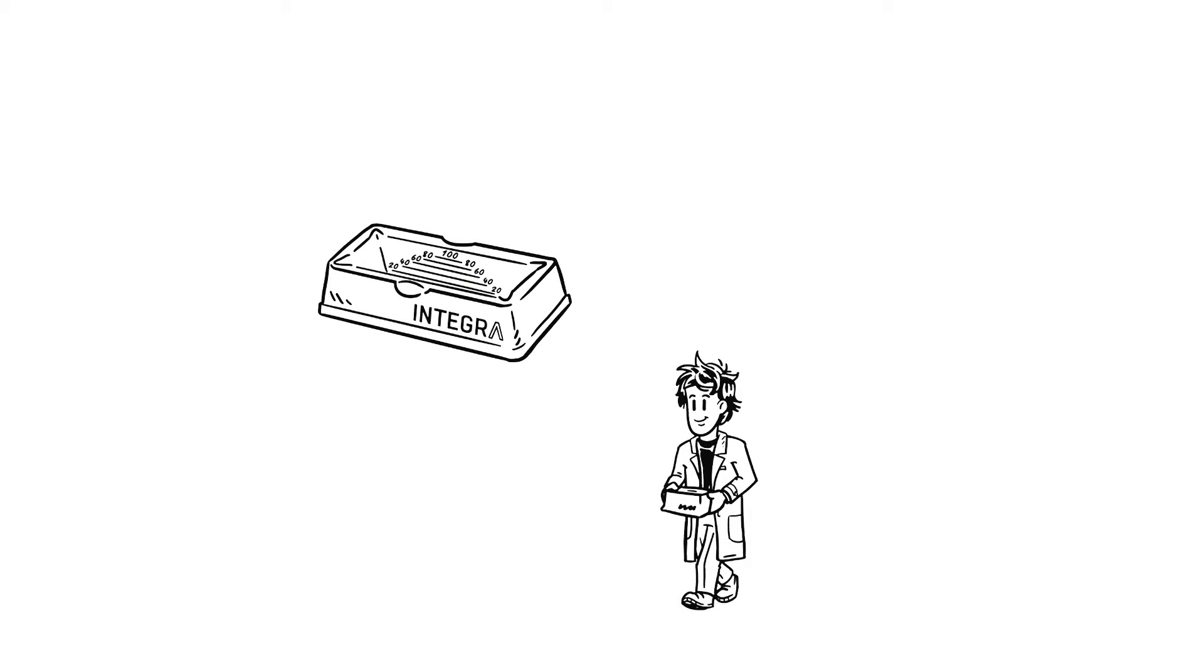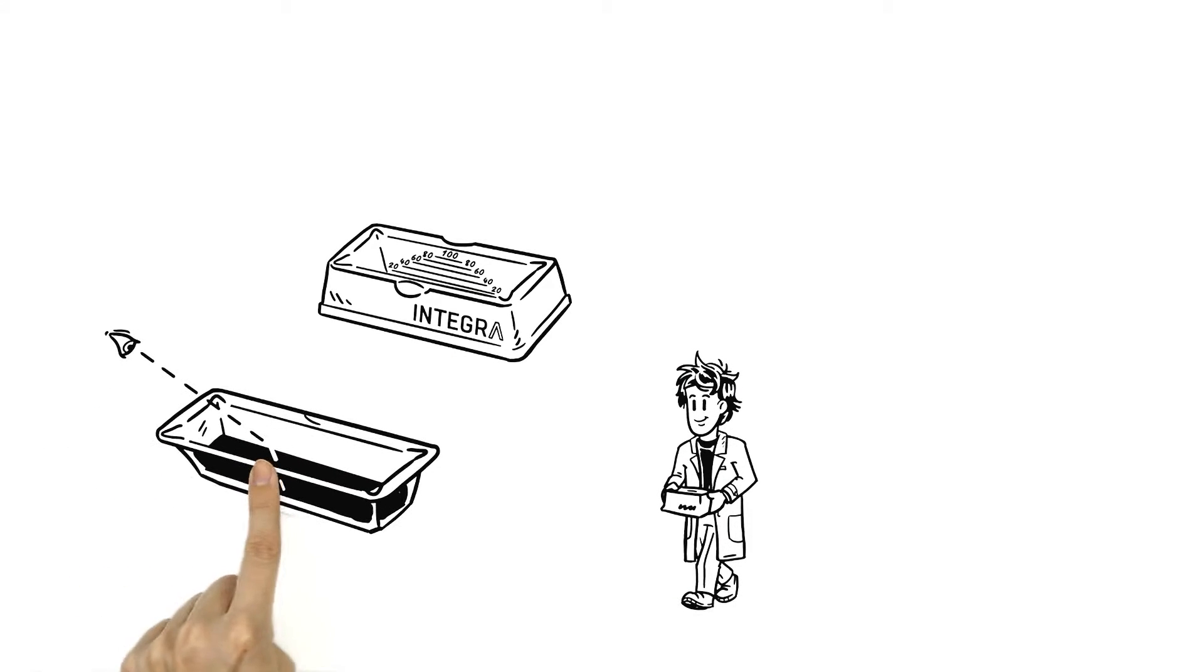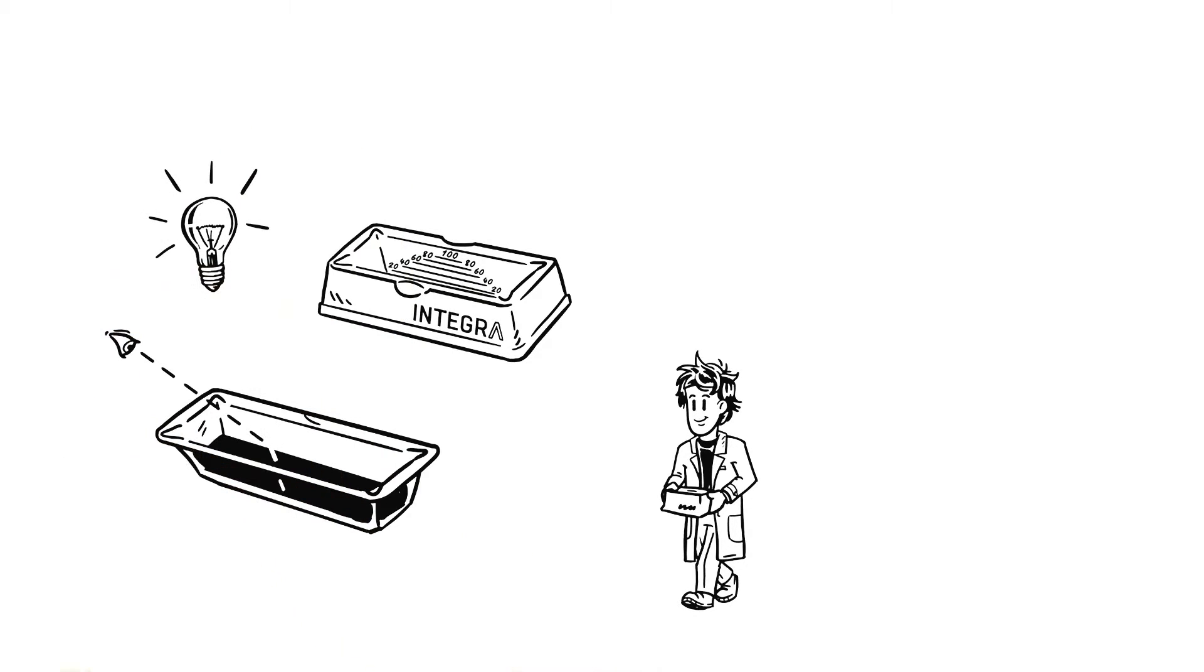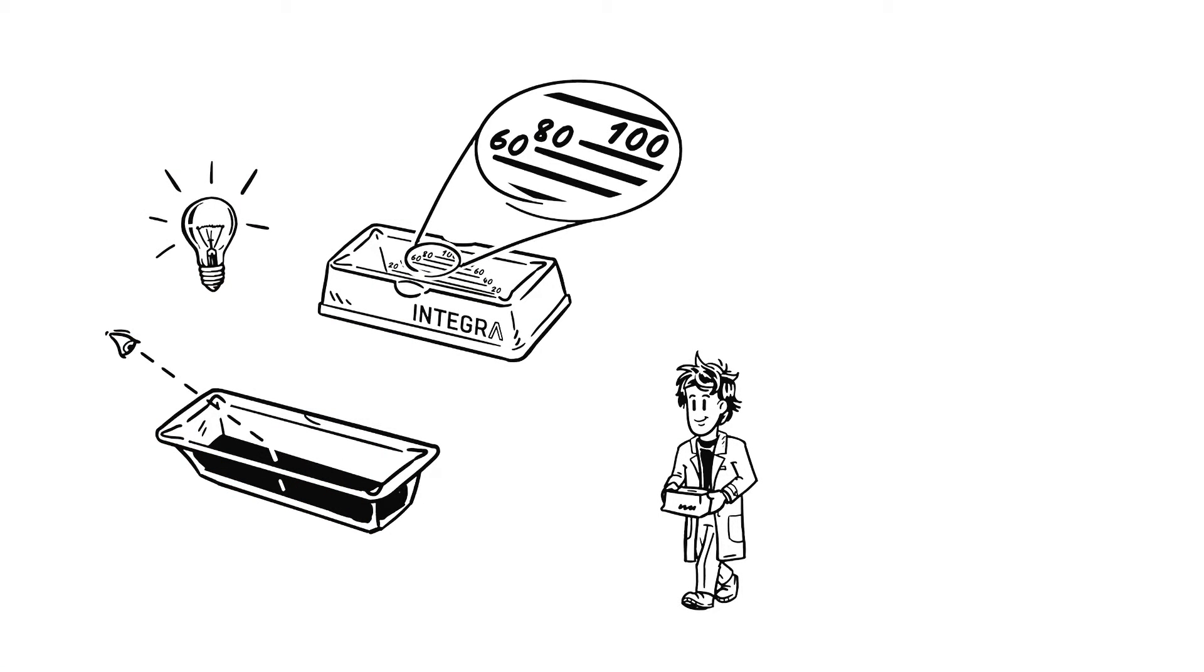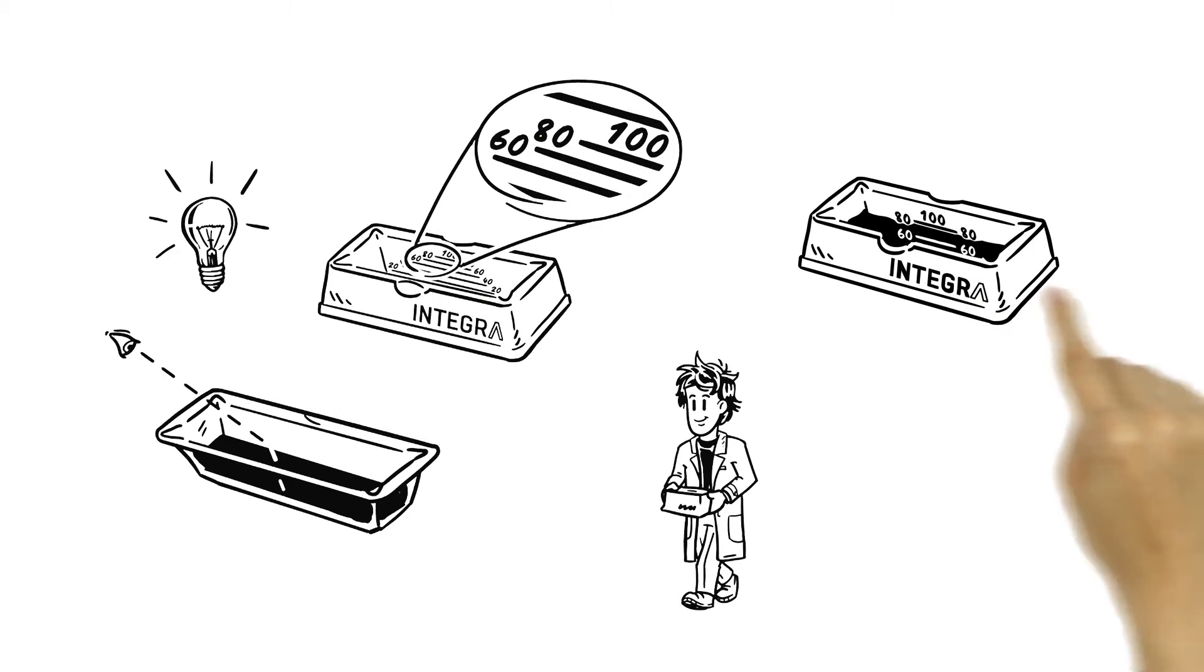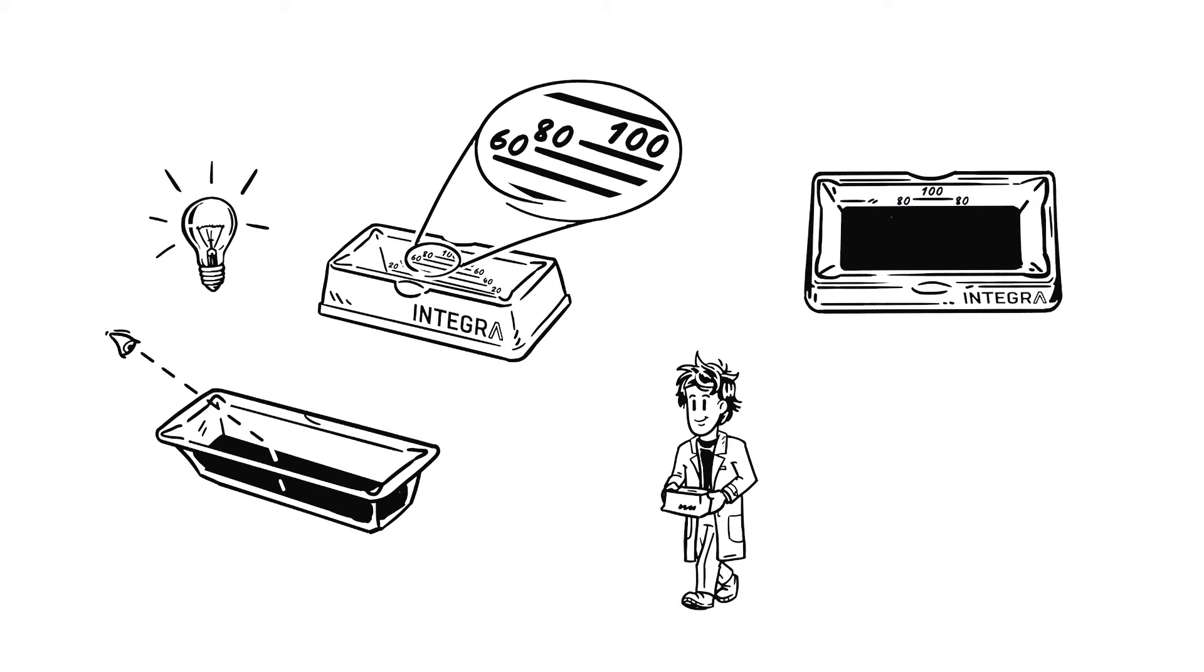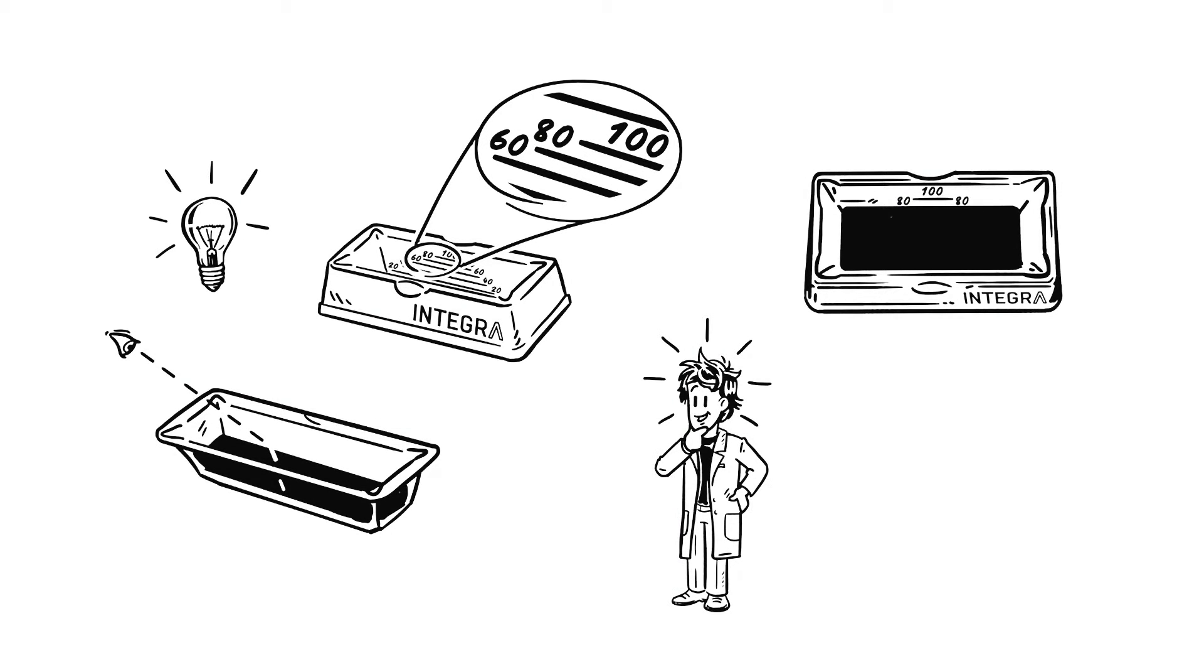The graduation uses the refraction of light on liquid surfaces in an ingenious way that makes it easier to identify the exact volume. Looking from the side, you see all graduations. Looking straight down, you only see the graduations above the liquid. Mason could spend hours gazing at the effect.